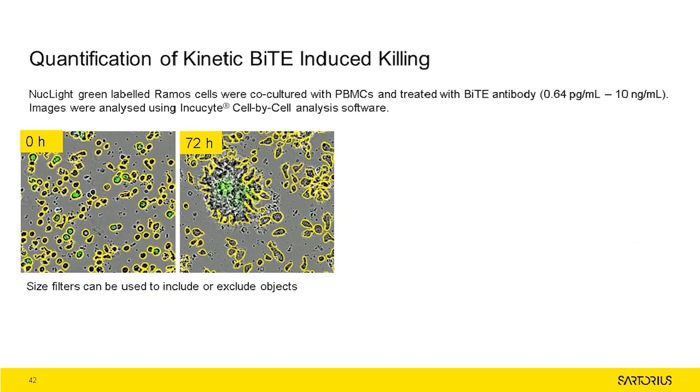Here, NucLight green-labelled Ramos cells were co-cultured with non-labelled PBMCs. The co-culture was treated with increasing concentrations of BiTE antibody for 72 hours. The images shown here are representative of the co-culture in the presence of 10 nanograms per ml of the BiTE antibody at 0 and 72 hours.